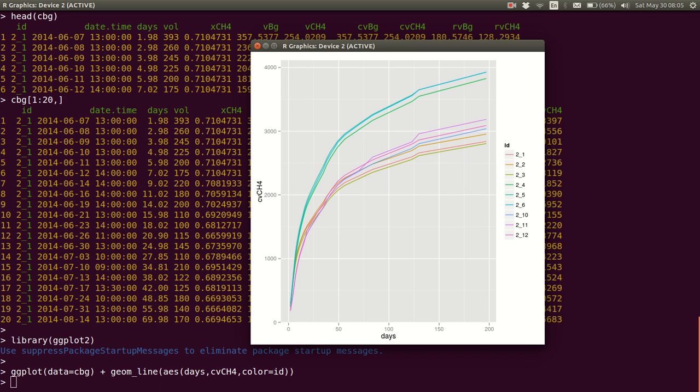The cumBg function is quite flexible. It can be used for volume measurements, as I just showed you, or for mass measurements, applying a gravimetric method. It corrects for temperature and pressure, standardizes to a default of 0 degrees Celsius, 1 atmospheric pressure, but those default conditions can easily be changed. There are 2 different options for calculating production, as well as different options for interpolation.